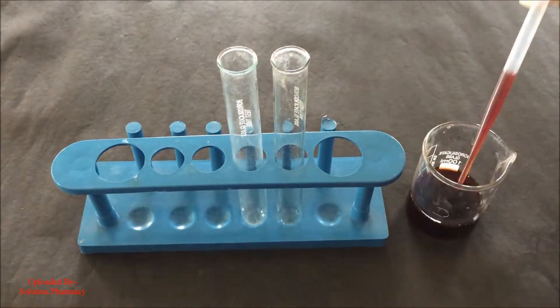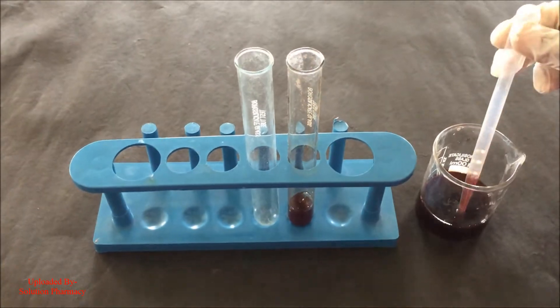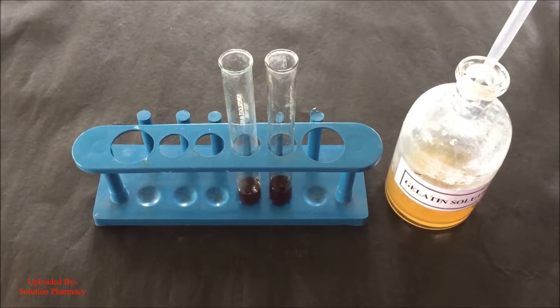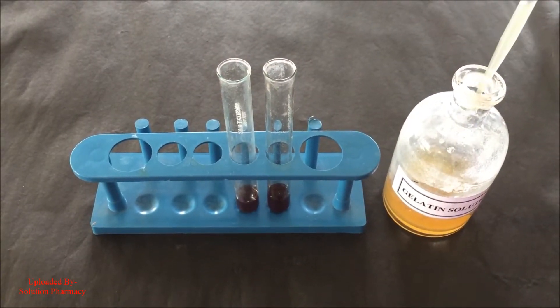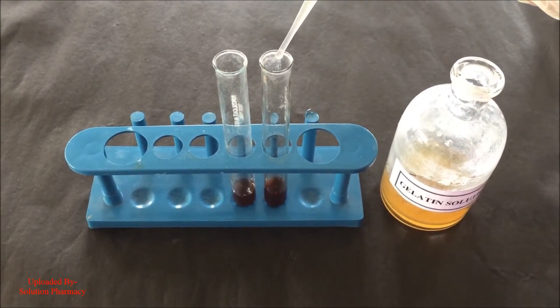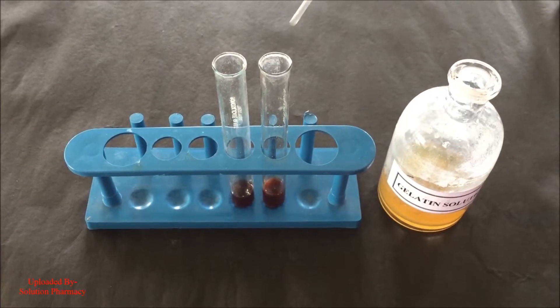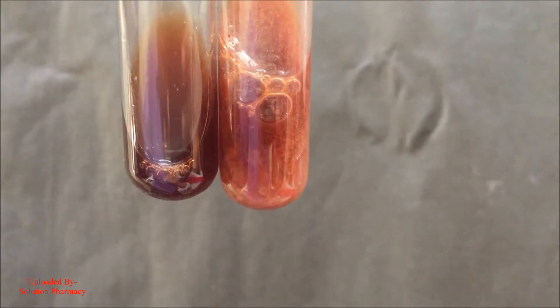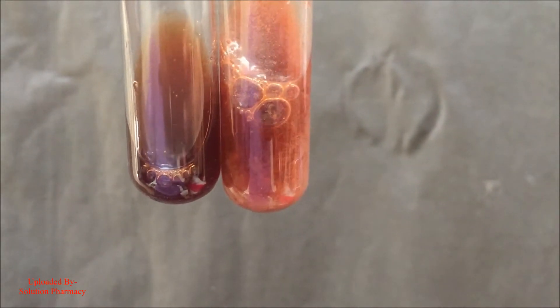Now we are going to perform the second test, that is the gelatin test. Again transfer 2 ml of the extract into both test tubes and then add few drops of 1% gelatin solution containing 10% NaCl to one test tube, and compare the changes with the second test tube. Formation of white precipitate indicates the presence of tannin in the extract.